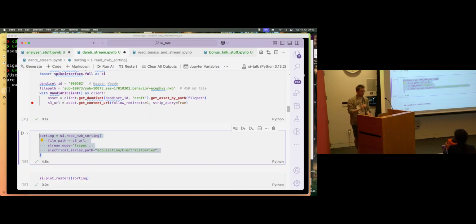So is it saved on an ADC channel in the... Exactly, yeah. So I think, wait, is it saved separately or is it saved in the same? It's in the same, it has a row together.